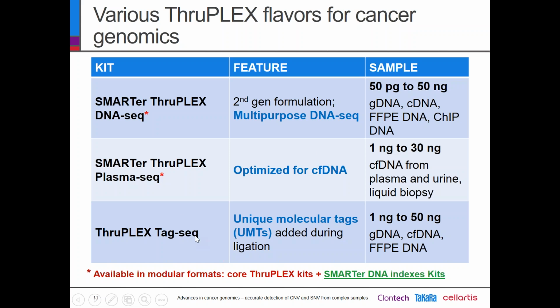And finally, we have a solution for when you are looking at rare mutations, rare alleles, meaning a frequency of roughly 1% and below.